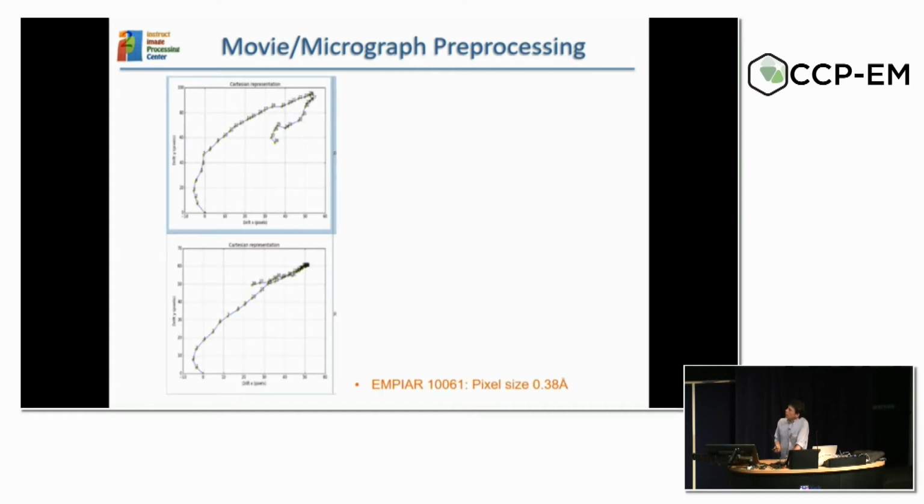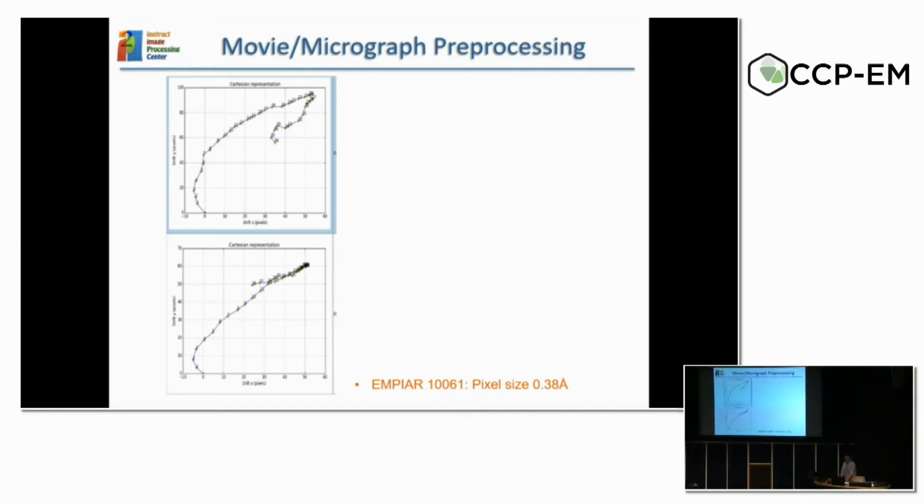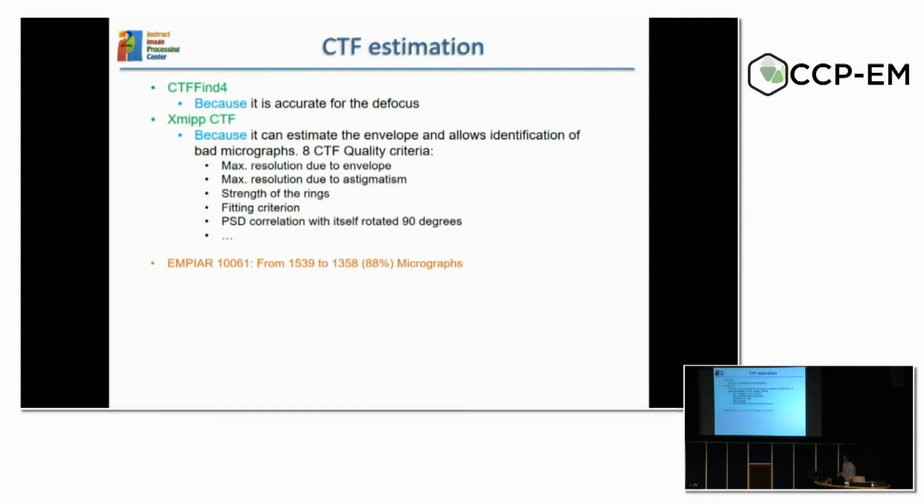And if you look at the shifts, for instance, the global shifts, they should look like trajectories normally, or a very small cloud of points, but very small shaking. But you shouldn't see strange things in there. For instance, at the acquisition, we have monitors that monitor these trajectories and automatically discard movies that look strange. They are put aside. The data is never deleted. You can always go back to the data and decide, I will take them in again. But automatically, they don't flow through the pipeline.